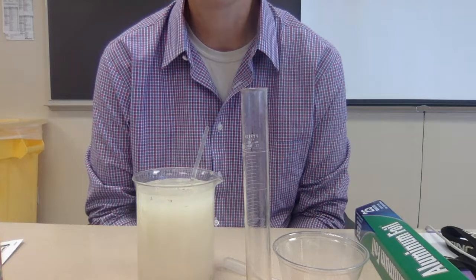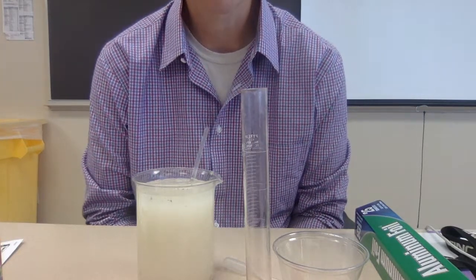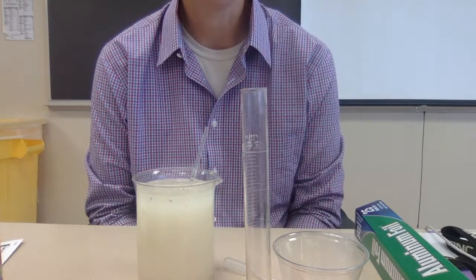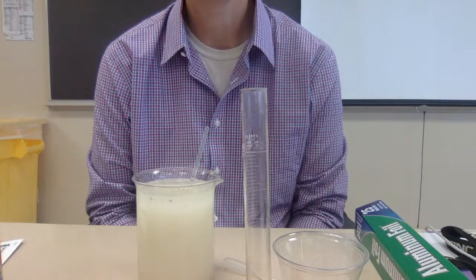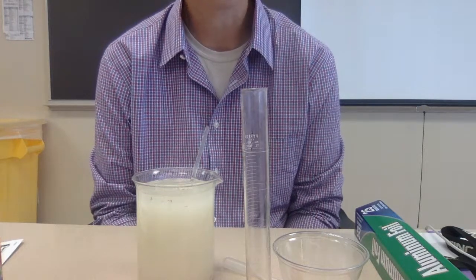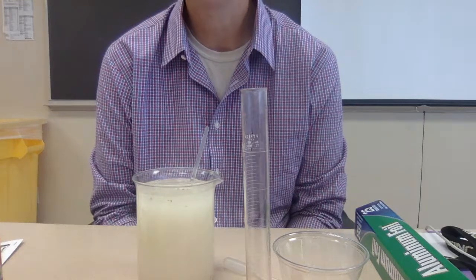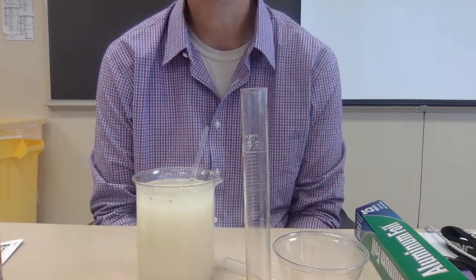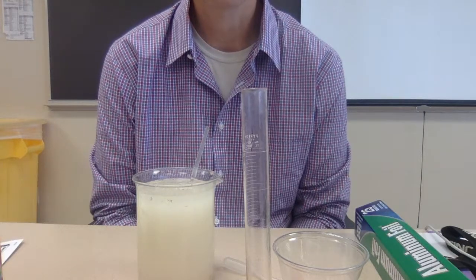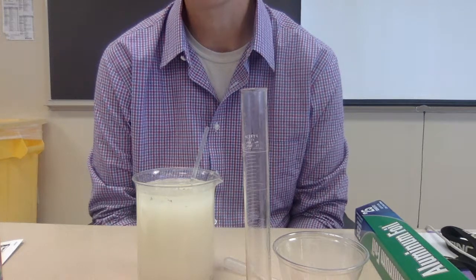Yeast reproduce through binary fission. So about every 20 minutes, they can divide and make another copy of themselves. So you can start out with one, and 20 minutes later, you'll have two, and 40 minutes, you'll have four, and 8, and 16, and so on and so forth. So we're going to see how their population changes over time and what kind of growth we see.